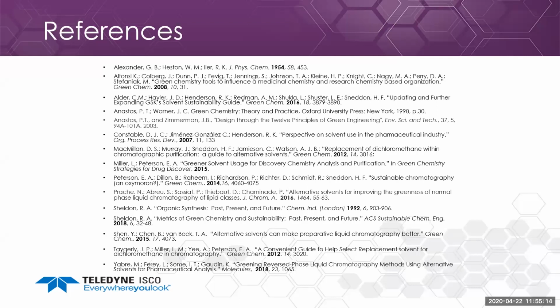There are going to be cases where you're not able to substitute with acetone, so you're not going to be able to make some of these changes for some of your applications. Sometimes you're going to be stuck with what you're already using, with acetonitrile or methanol or things like that, and you can't necessarily make the change. So it's going to be unique to your samples.